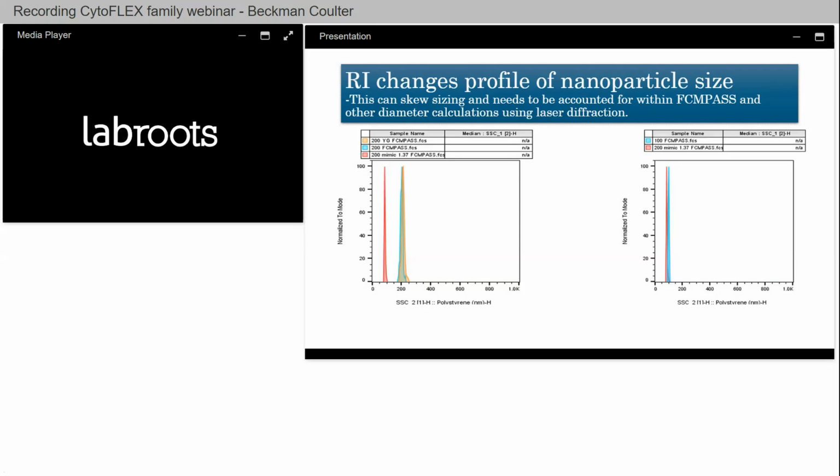And so these are things, again, that we've got to think about in how we actually set up our instruments and what kind of reference materials we use to start comparing and contrasting results. And this is just within one instrument. But imagine how this would actually start a domino type effect or become exponential when you're doing it between instruments or between institutions.